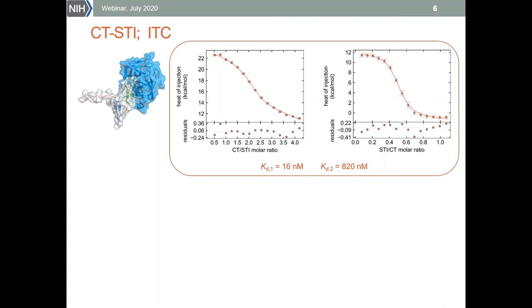Here we see results obtained for the system by isothermal titration calorimetry. The ITC calorimeter directly detects the heat of the reaction associated with complex formation, so no protein modification is required, but we still obtain similarly different results depending on the direction of the titration — one signal curve is steeper, indicating stronger binding, and the other is more shallow.